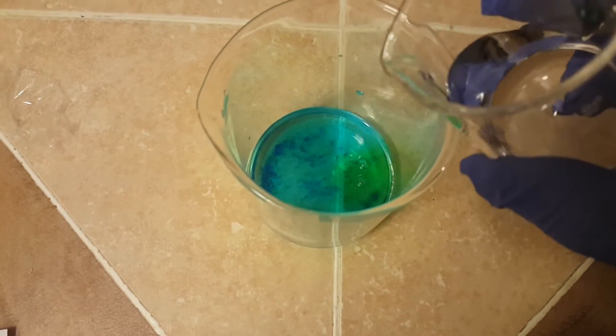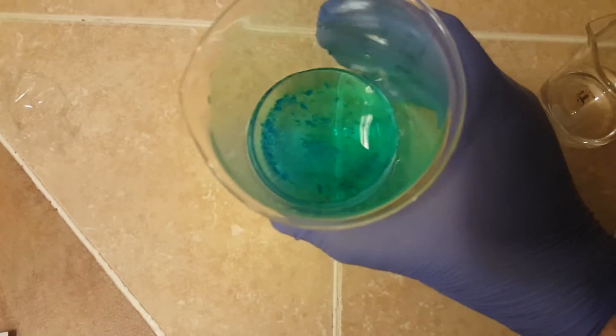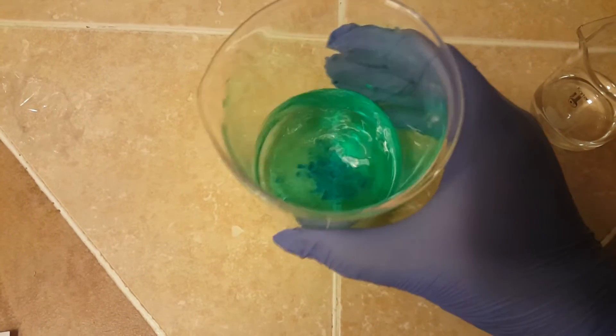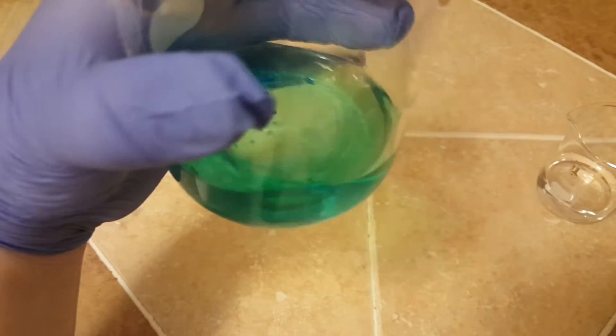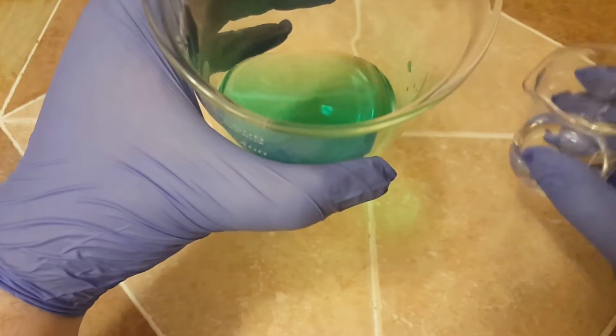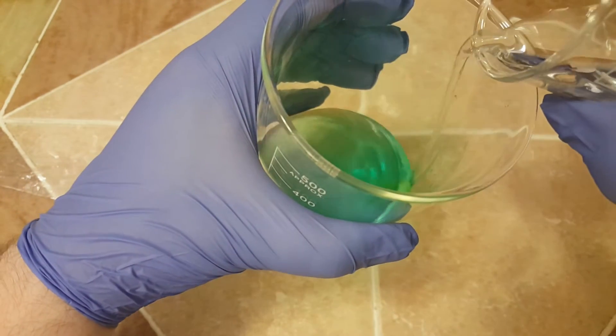You should be able to see a nice green color form as the sodium metabisulfite is added to the copper sulfate, and this is typically indicative of a copper 2+ molecule being formed. Now that most of the copper sulfate has reacted, I'm going to go ahead and continue the reaction by adding the rest of the sodium metabisulfite solution to the copper sulfate.